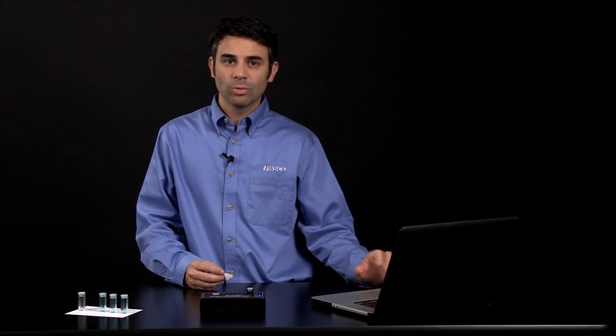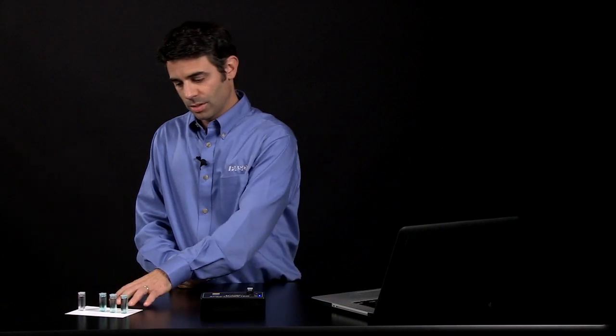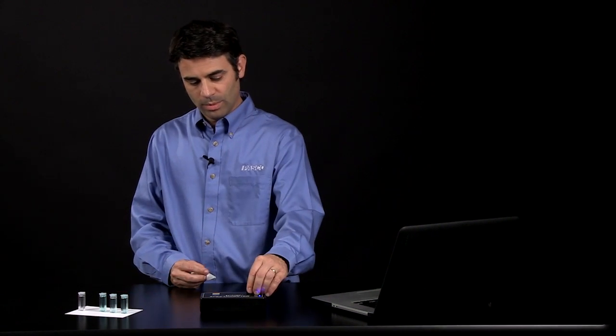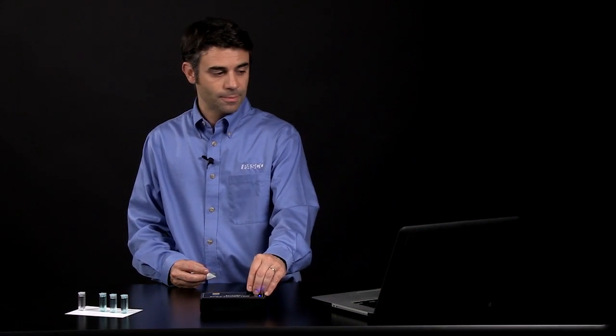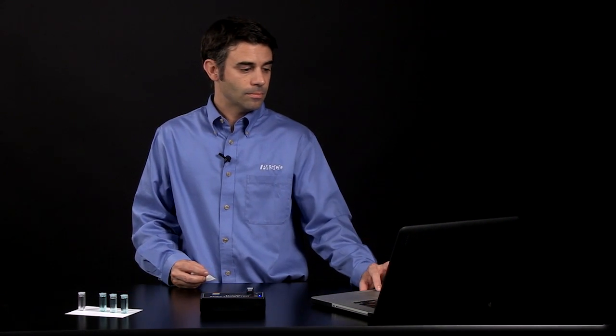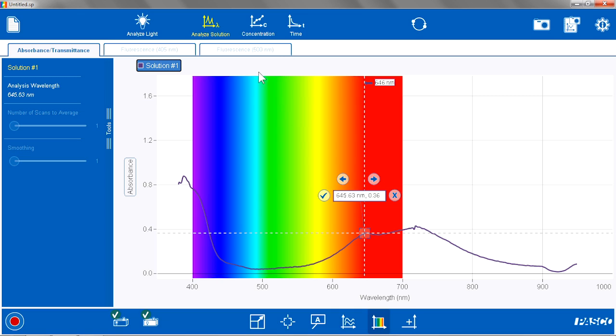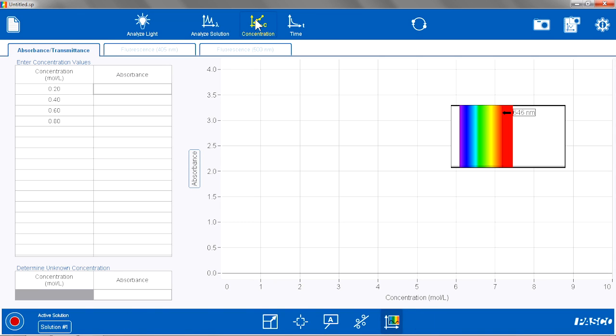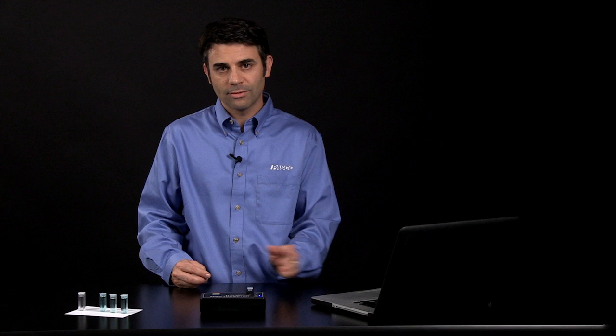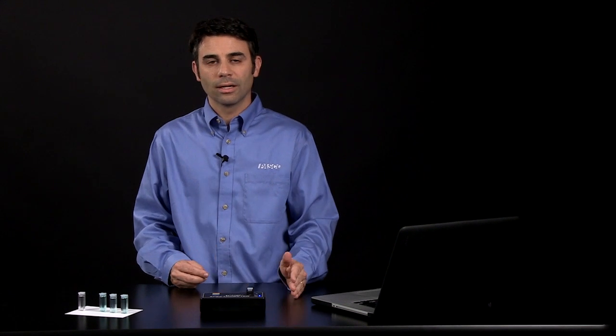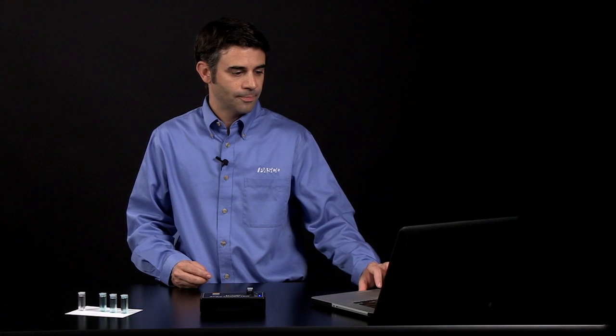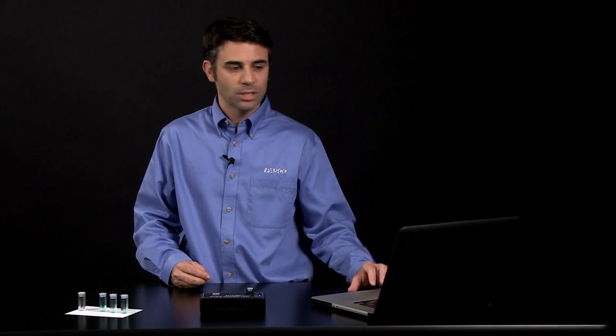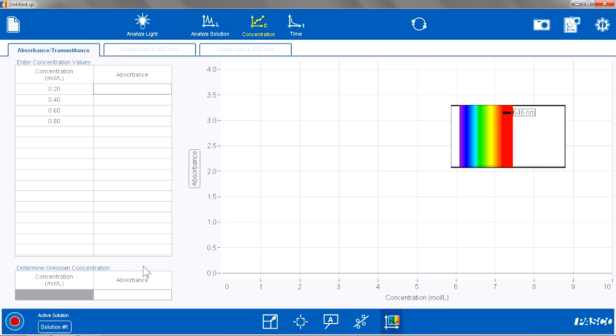Now I am ready to do my concentration studies using my standards. I am going to go to the Concentration tab in the software. In this tab, it is set up for Beer's Law. I can enter concentration values, it will record the absorbance values. I will see a live scan of the full spectrum of the absorbance from 380 to 950 nanometers, or whatever region I have selected. I will be able to determine the unknown concentration using this separate table down here.